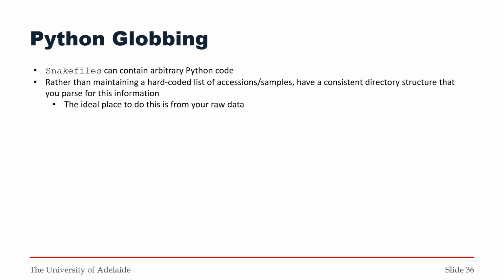One thing that may be interesting is, rather than specifying input files by sample or by accession, as in this example workflow, rather than hard coding it, you might want to have the workflow and Snakemake determine that based on a directory structure. If you have a directory structure that allows, you could have it parse that structure to pull out that information. So something like this here, Snakemake provides glob_wildcards, which is a way to glob the directory structure and pull out some information.